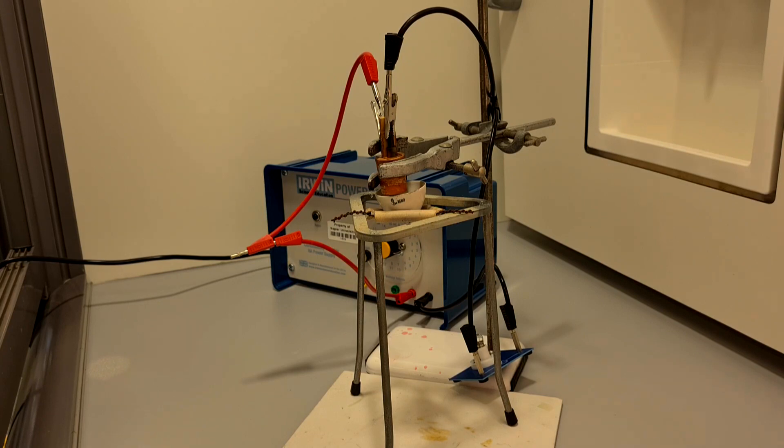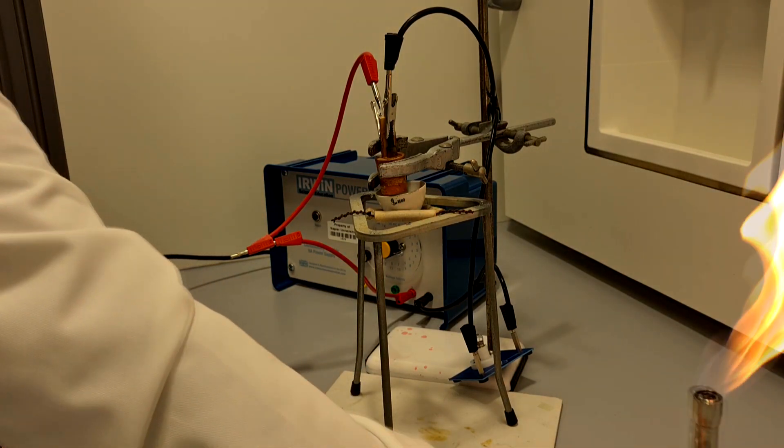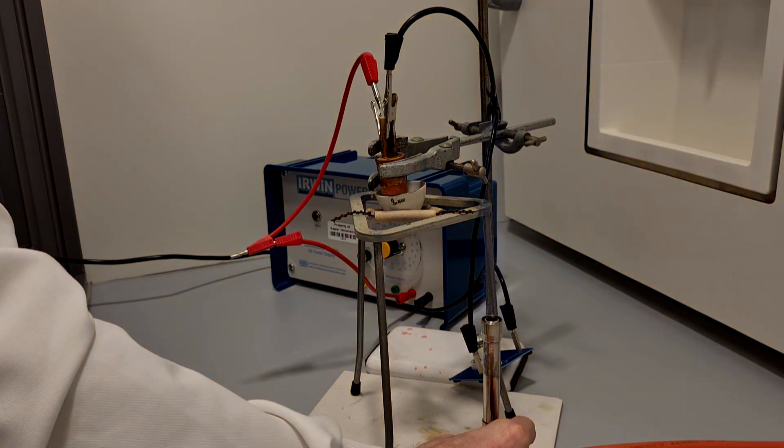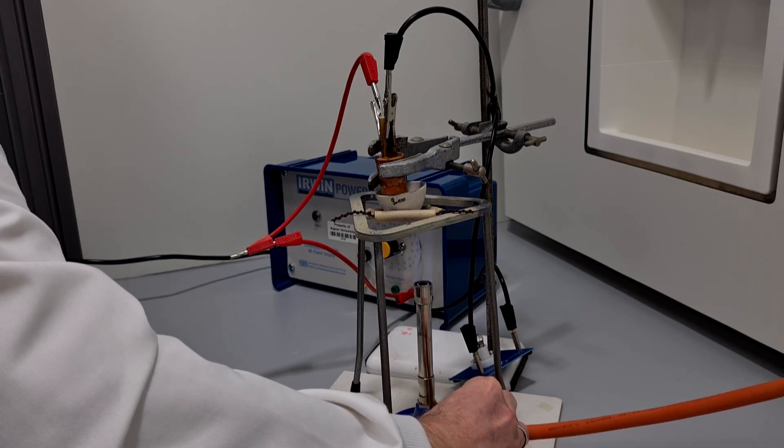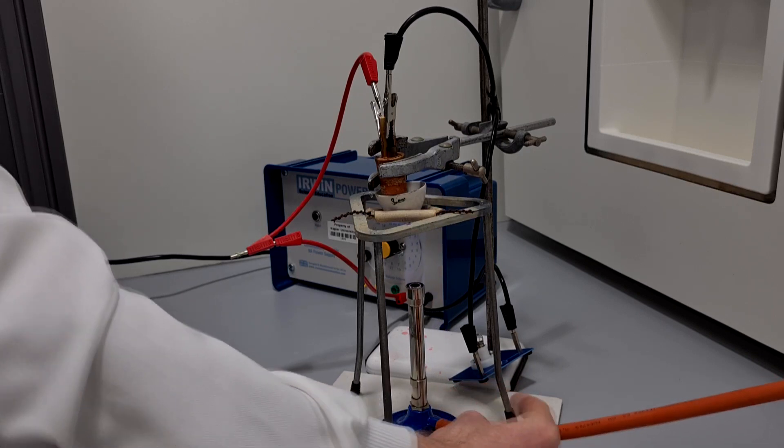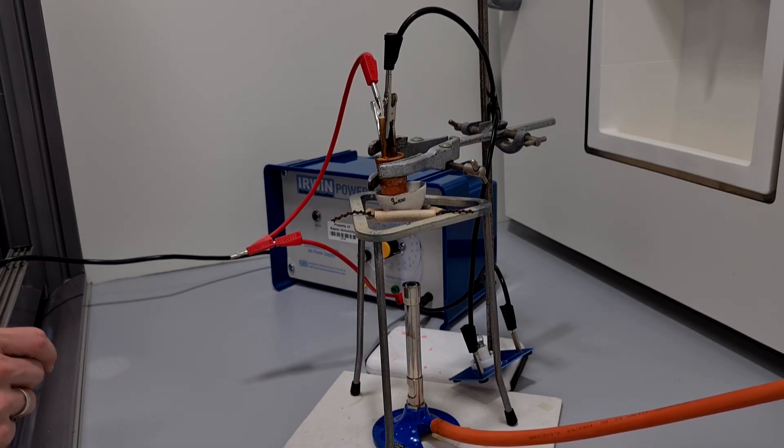So what I am going to do now is I'm going to place the Bunsen burner under the crucible, turn it into a gentle blue flame, and we'll gently heat the zinc chloride powder and we'll see if we see any change in the conductivity of the zinc chloride.